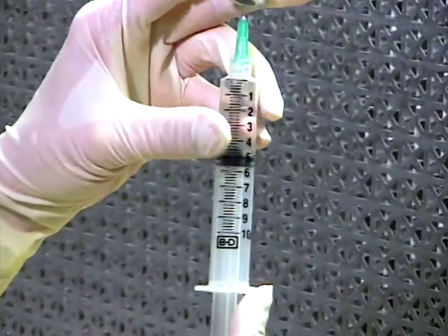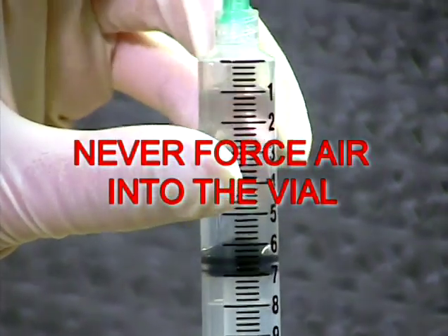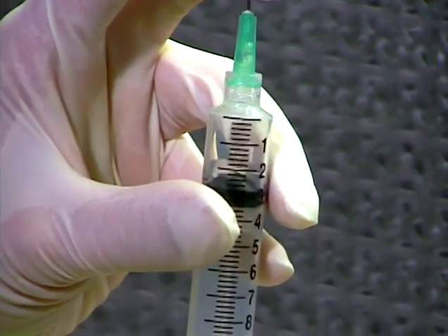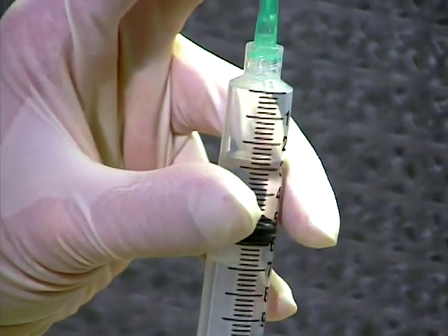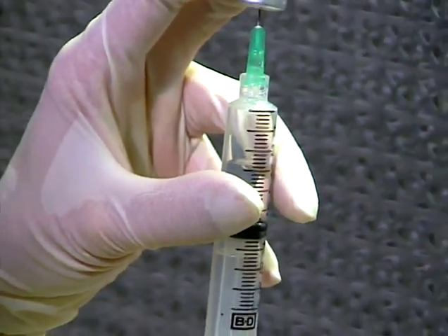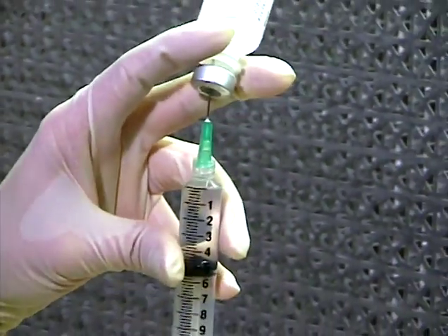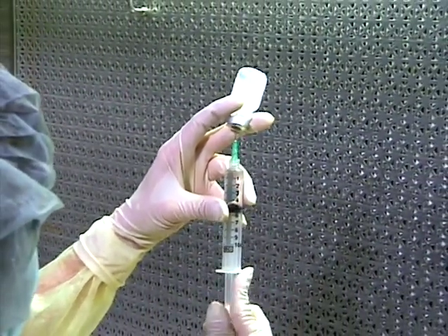Avoid pushing against pressure on a syringe plunger during any vial compounding procedure, and never force air into the vial. Rather, keep the needle below the fluid level and pull back on the plunger, allowing fluid to enter the syringe. When resistance is encountered, release the plunger, allowing air to enter the vial until the pressure is neutralized. Repeat this procedure in a seesaw manner until no air remains in the syringe. Dislodge all air bubbles and clear any air from the hub of the needle. Continue to gently withdraw fluid into the syringe until the required dose is achieved, and the system is now under slight negative pressure. This method is known as low pressure or seesaw technique.